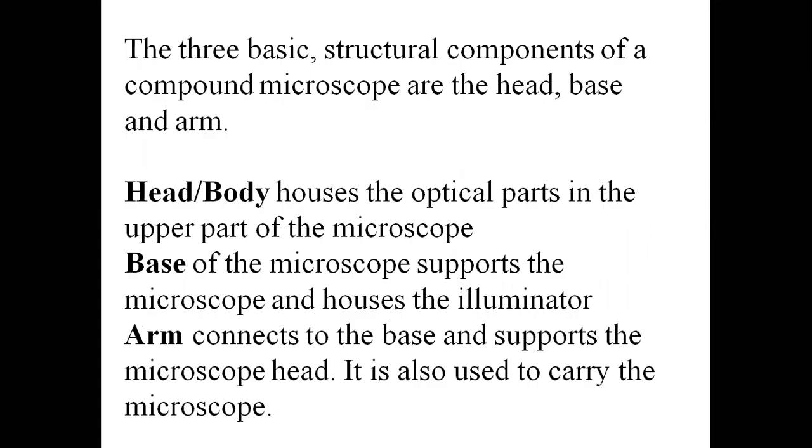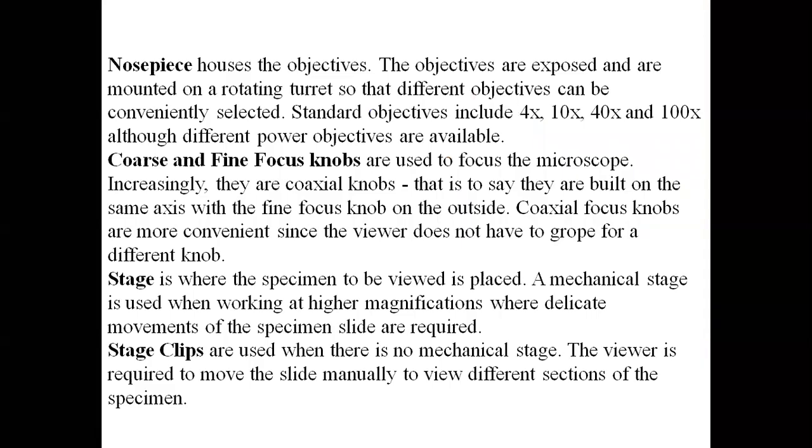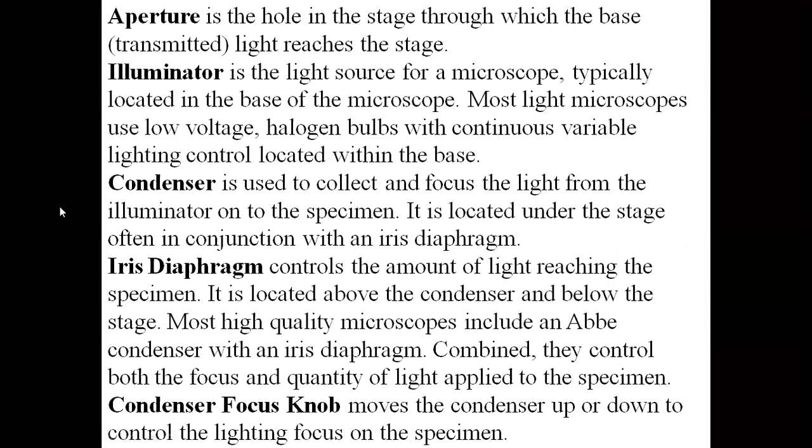Then there is one more thing: whatever amount of light this illuminator is giving, that amount of light can also be controlled. That is what it is saying.